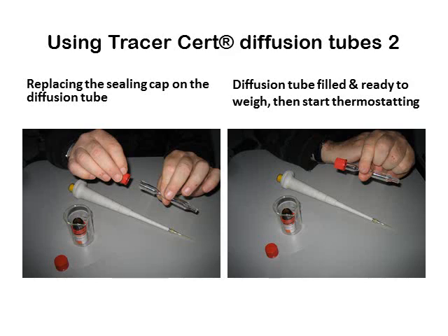After that, replace the screw cap and tightly screw it back onto the tube to seal that end, and weigh the tube using a precision balance able to weigh to plus or minus 0.1 milligram, or for example using the semi-micro precision balance with which we can weigh up to plus or minus 10 micrograms.